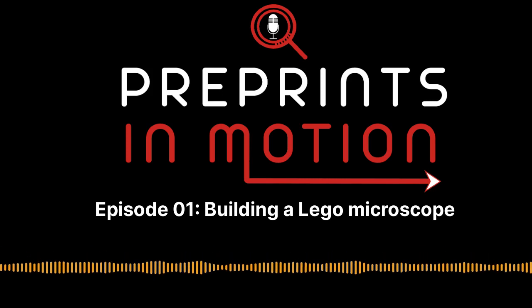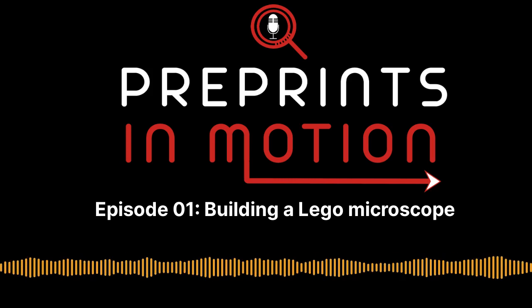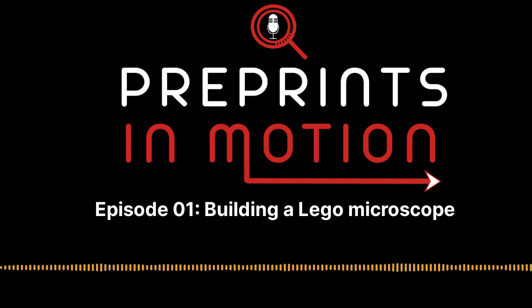Brings us back a few hundred years, and it seems simple, right? A Lego microscope, really simple, but you're actually bringing about a lot of complex things, a lot of history, and it's such a good, useful tool for teaching.